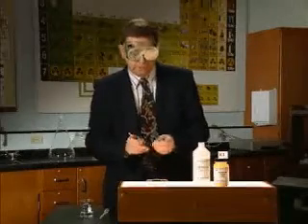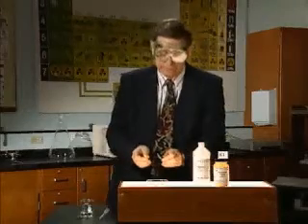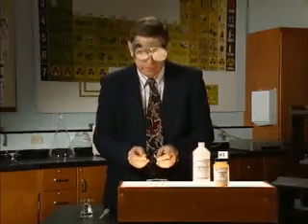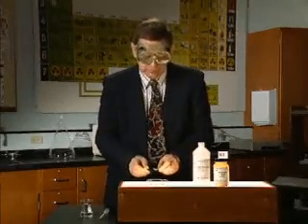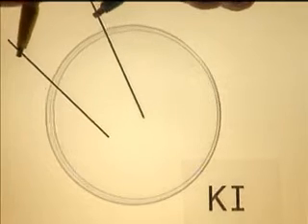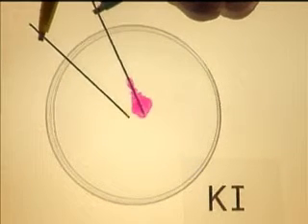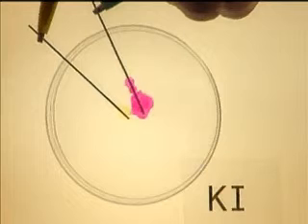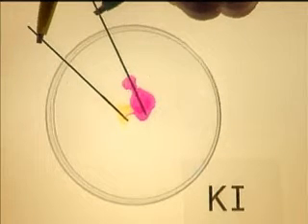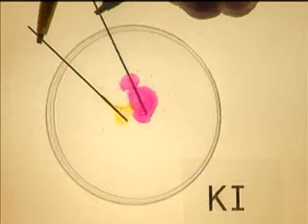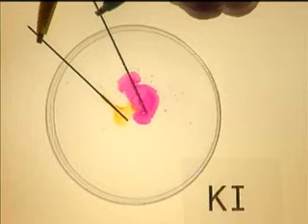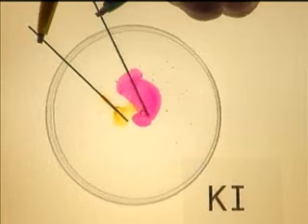We've connected two pieces of carbon pencil lead to serve as electrodes to a variable power supply. We're going to place those into the solution. The bubbling is occurring at the cathode as hydrogen is produced, and the solution around the cathode is turning pink as the hydroxide is generated in the presence of phenolphthalein.